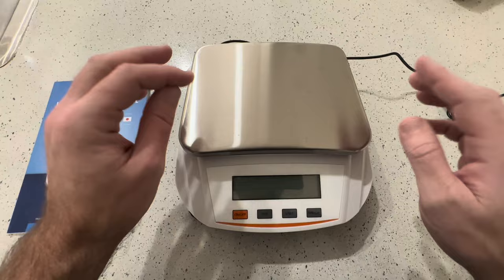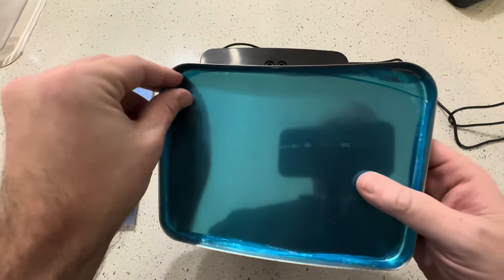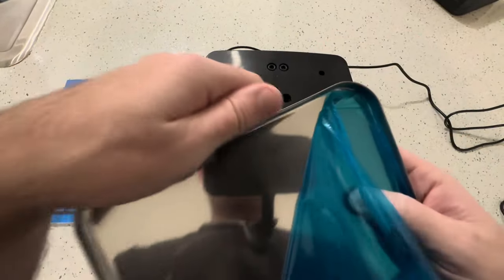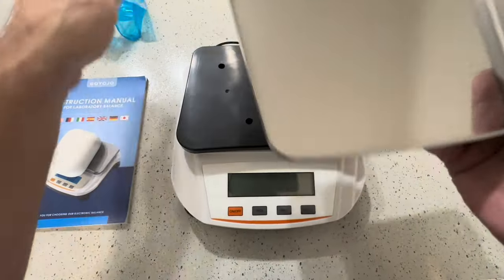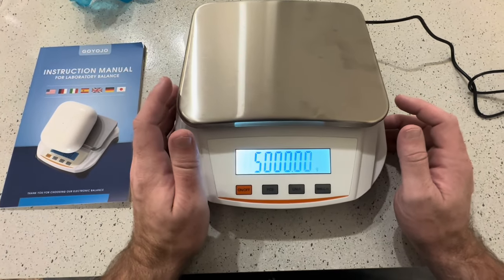One thing I will say — when you get this, make sure you peel off all the plastic. The top has a big one, but the one I didn't peel off the first time was this blue cover on the underside, and it really threw off everything I was weighing. So make sure you peel that off.